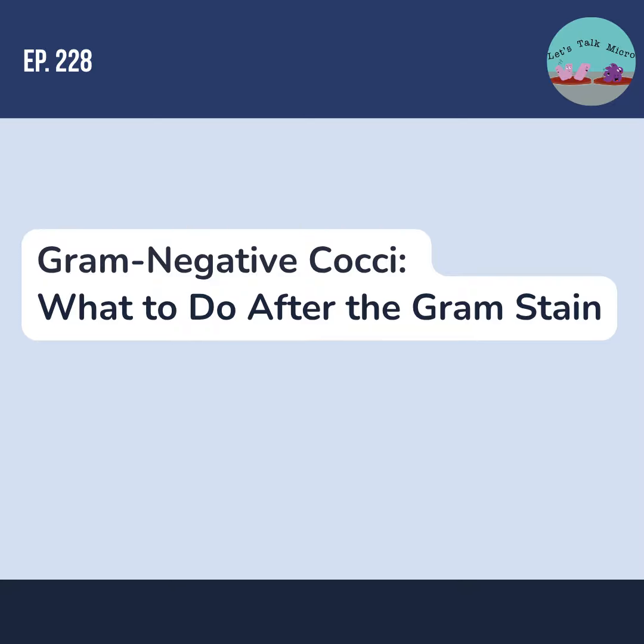Otherwise, you can get some false positive results. And this brings me again to, if unsure, you always do a gram stain. Of course, as you become more experienced, you see some organisms and you already know what they are. You have an idea. You get proficient enough that you can do that.